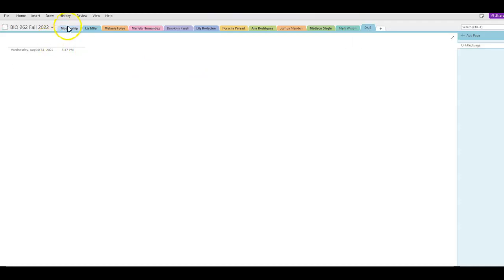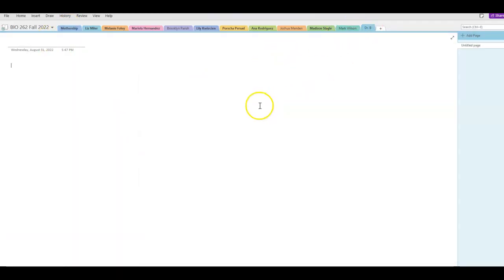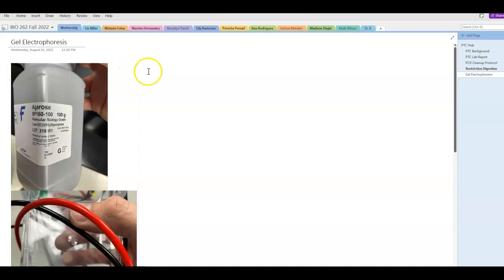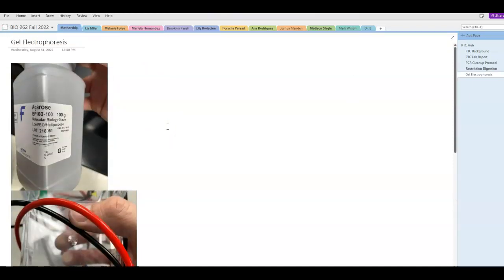And so I really have to transfer the idea of what's over here over to my notebook, which by the way would be like your notebook or any of the other people up here. So let's say the first thing this is about is gel electrophoresis. Maybe this is something we did this day. And as you know, if you did do something, you would have had other notes in your notebook that you took. So what would I do?